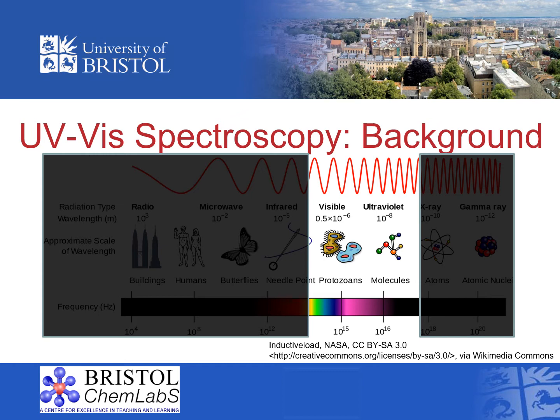For example, the delocalized electrons that are part of the C-to-C double bond found between two carbon atoms, or those found within transition metal compounds. The ultraviolet or visible wavelengths are of the correct wavelength to be absorbed and to give these electrons energy, exciting the electrons into specific higher energy states. Depending on the two atoms involved in the bond, the number of double bonds that are conjugated, or the transition metal complexes that are involved, will determine which section of the spectrum is absorbed.